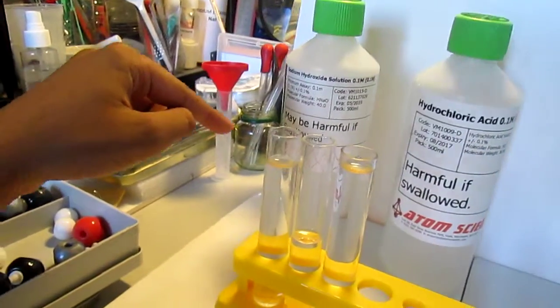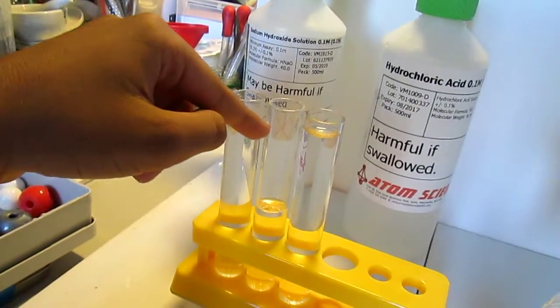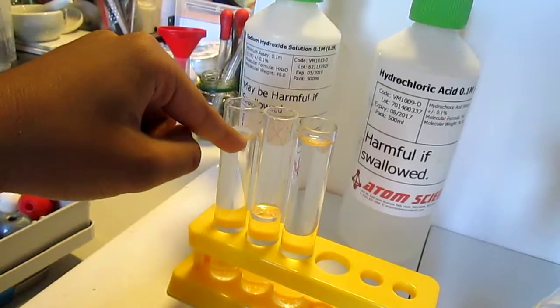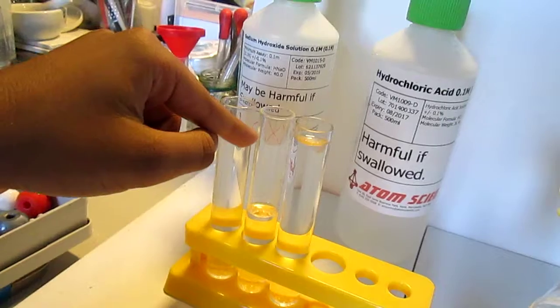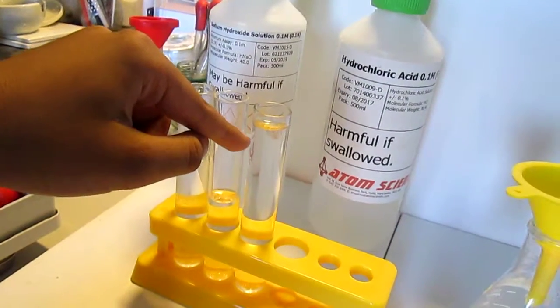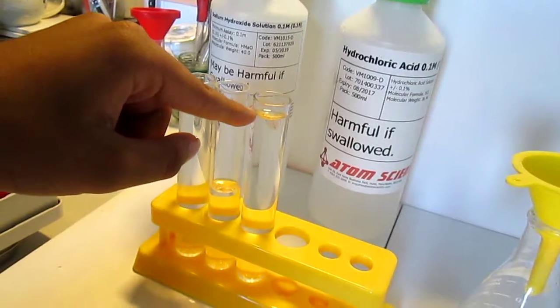The first test tube on the left contains phenolphthalein. The second test tube on the left contains sodium hydroxide which is a strong alkaline. The third test tube contains hydrochloric acid which is a strong acid.